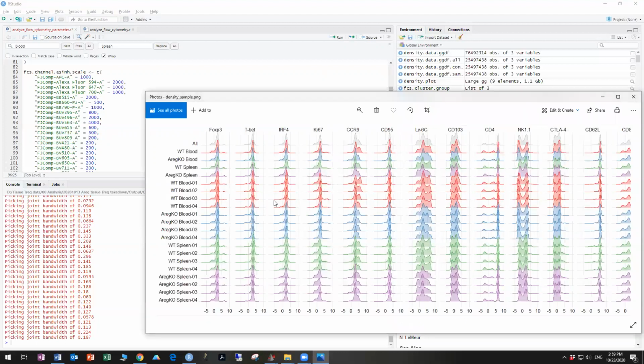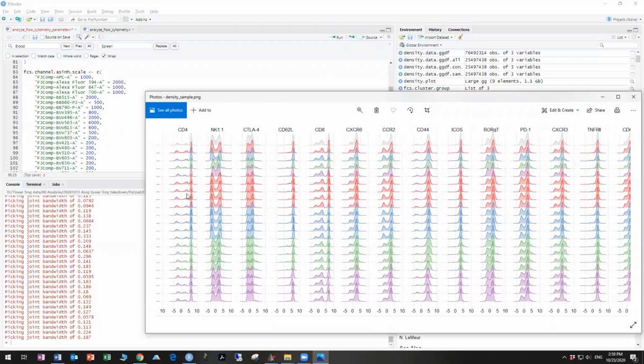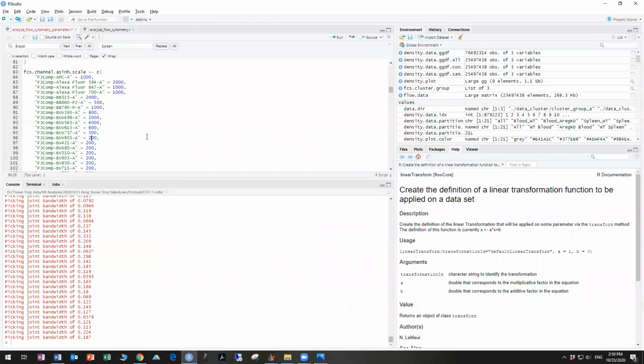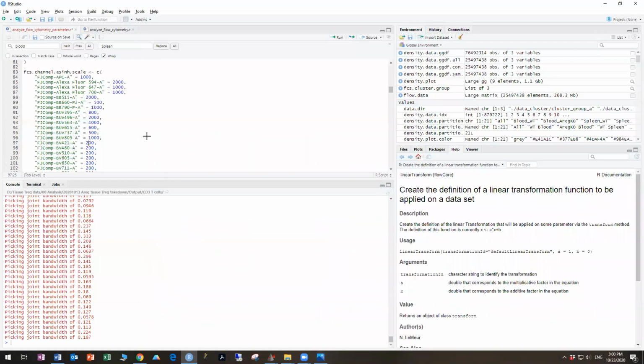The other thing we will try to do with this is adjust the amount of separation there is in the data such that each parameter is contributing equally to the separation in the tSNE. That's a bit harder to do. Most of that's being done by the design of the panel rather than at this point on your actual analysis.